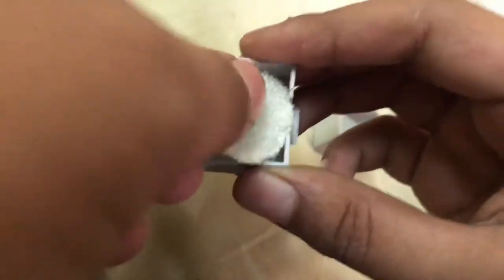Come on, man. Open. Yes. Cover slips. Yeah. Sorry. Okay. You stay there. And now, what is here? Nothing. What are these? Lenses. 15x. This one. 10x. Good.